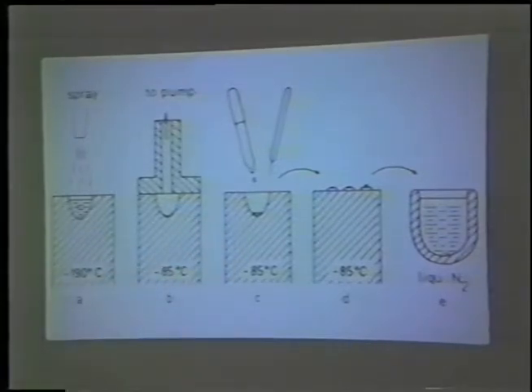Now, this technique, unfortunately, is of limited usefulness. If the cells are too large, if they approach the droplet size, it turns out that the airbrush acts like a miniature French press. Unless the cells are very small or protected by a rigid cell wall, the shearing forces that they encounter going through the venturi just rip them up.